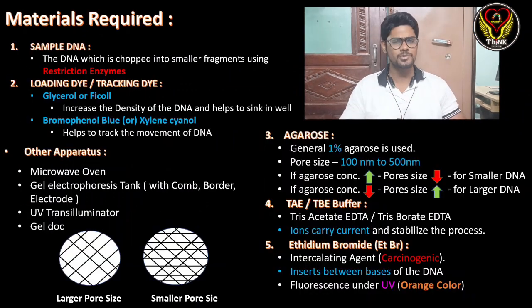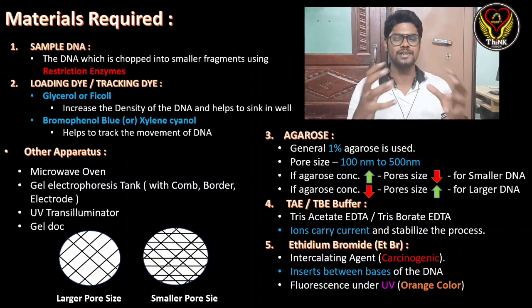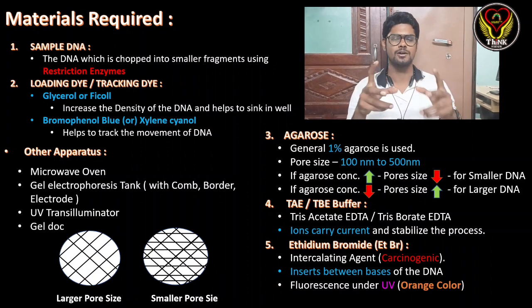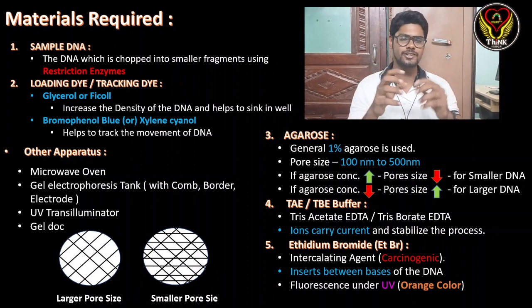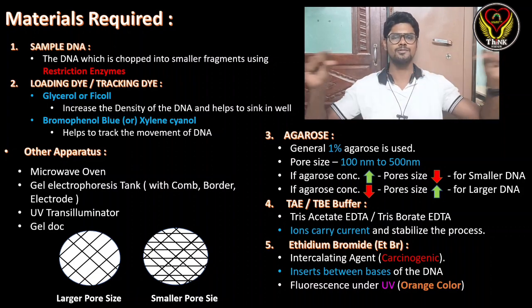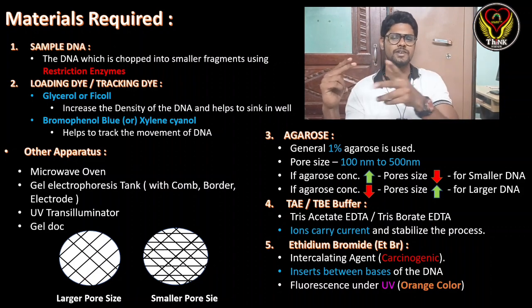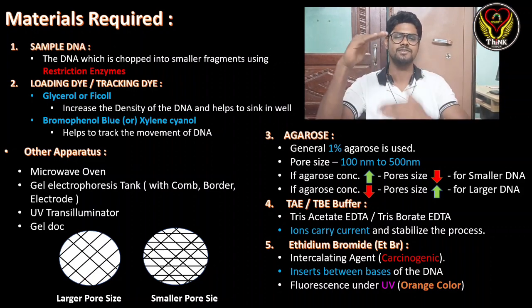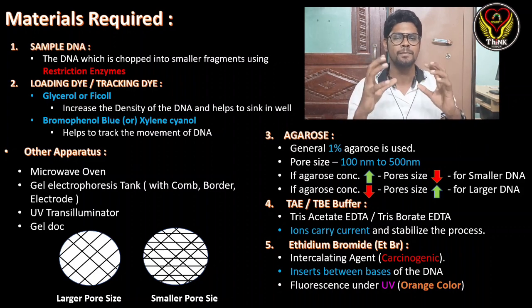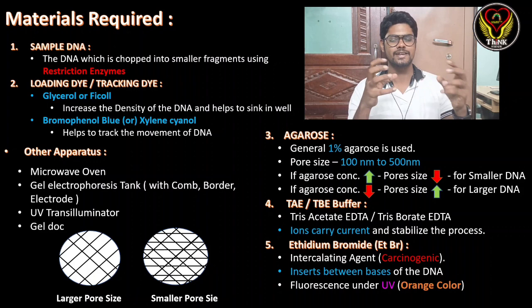Coming to the important components of agarose gel electrophoresis, there are around five things. Actually, more things are there, but these basic five are very important. The first thing is sample DNA. This sample DNA has to be chopped using restriction enzymes so that it has different sizes. We can't separate a whole long DNA molecule in agarose gel electrophoresis, so we chop it into different sizes so that we can separate them based on their length.